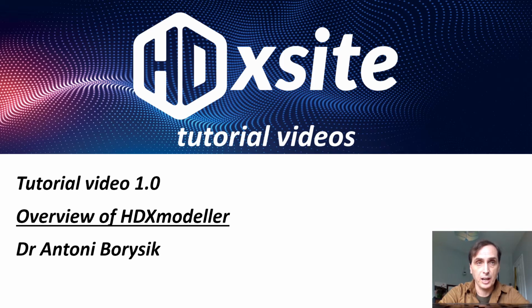This first video is just an overview of HDXmodeller, so a quick overview of the optimization process in general, and also some information on why I think that the optimization of HDXMS data is useful.